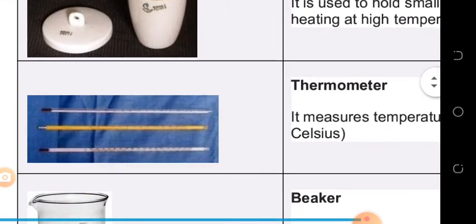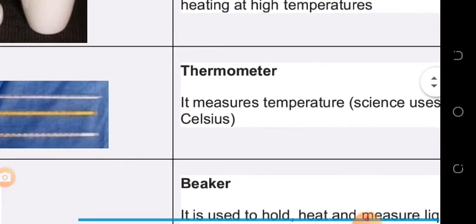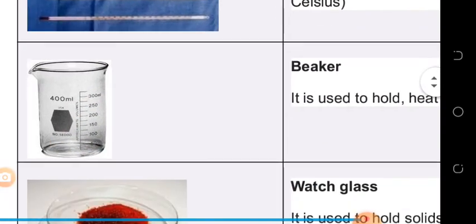Thermometers are very important in everyday life, especially in experiments to measure temperature. And also in our everyday life it is used to measure our body temperature or temperatures for animals, but these are made specifically for measuring the temperatures, mostly for science use, for example in chemistry.